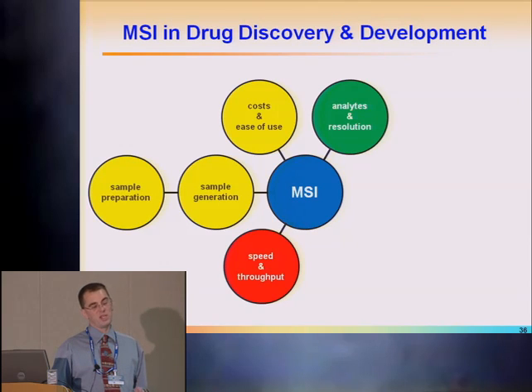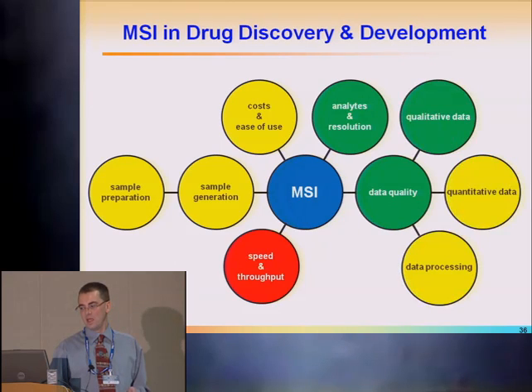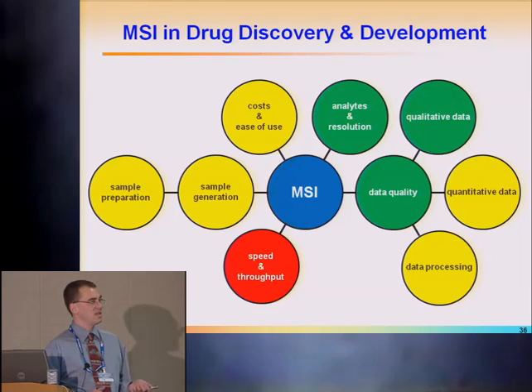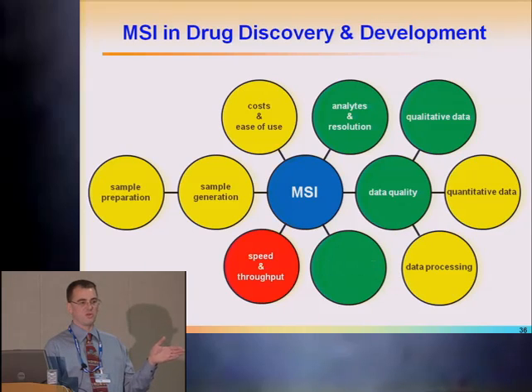The sample preparation: most techniques don't have sample preparation with MALDI. You still have to work with it and try your best. I think the data quality is outstanding. The qualitative data is outstanding. The quantitative data and the data processing is still a little bit cumbersome, but people are working on it. And so far, on any samples that we received for imaging mass spectrometry, we had impact on the program. So there's clearly a return on investment for MSI in drug discovery and development.